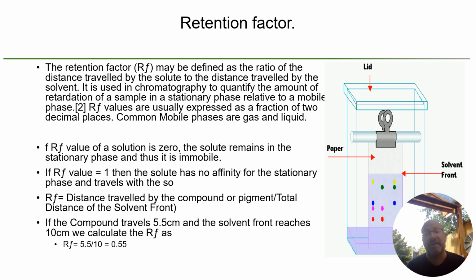And again, the common mobile phases here: gas and liquid. We're going to be working with water and alcohol, probably isopropanol, as our solvents in today's exercise.